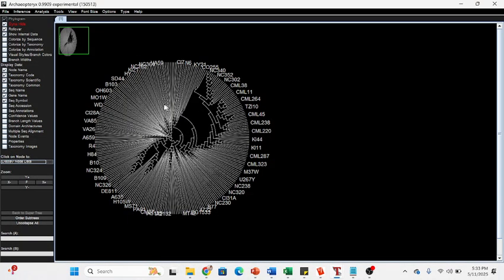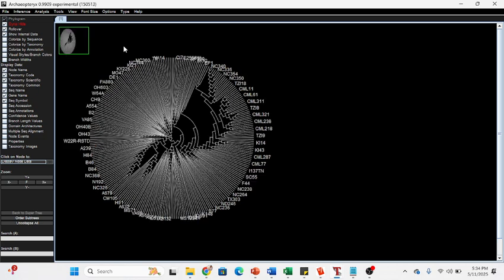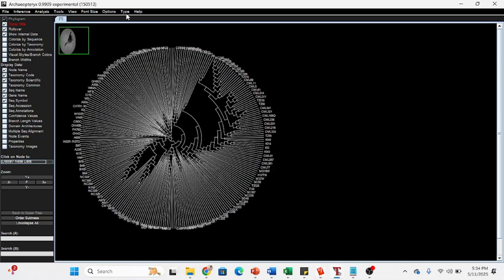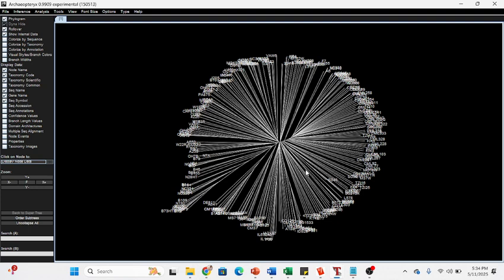Here you can count the clades, meaning how many clades or clusters there are in your genotypes, and you can also show the genotypic diversity. You can also convert it; there are other options like unrooted. From this you can easily count the clades: 1, 2, 3. Likewise you can count the clades to check the clusters or subpopulations in your population or panel.